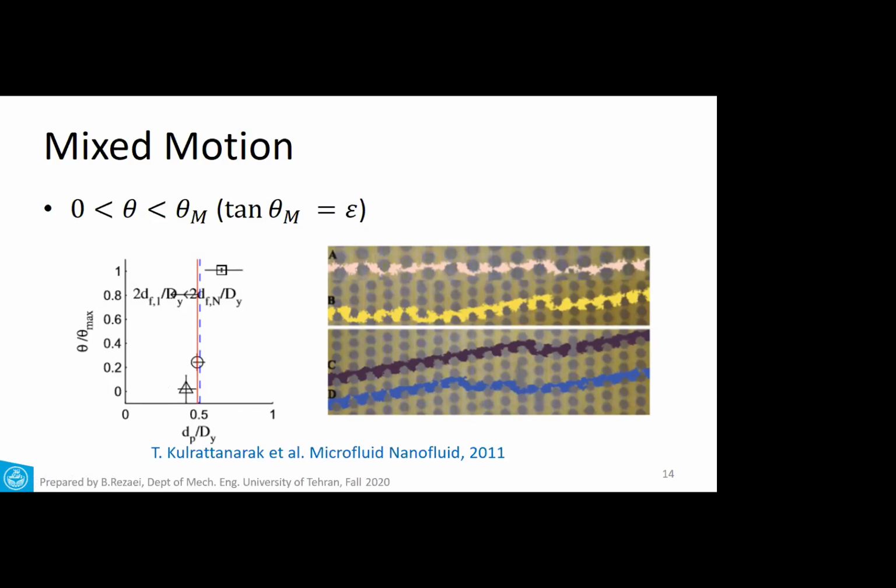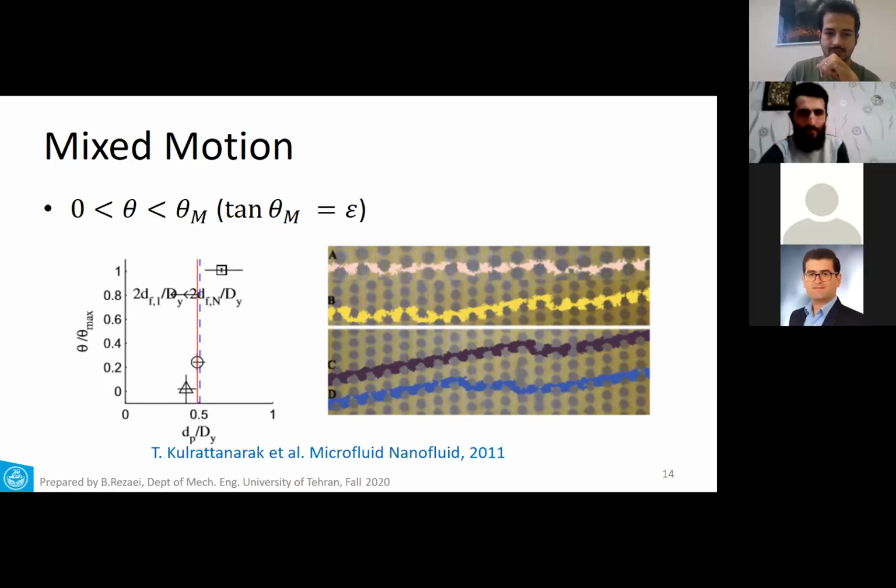So there is a third mode of displacement, and it is called mixed motion.